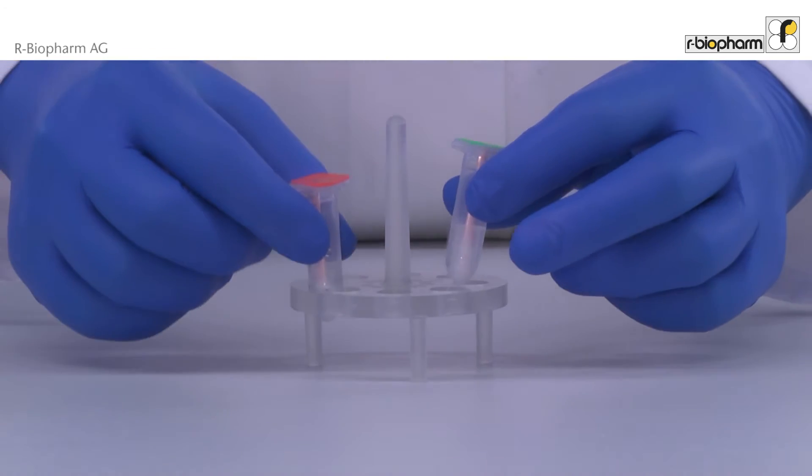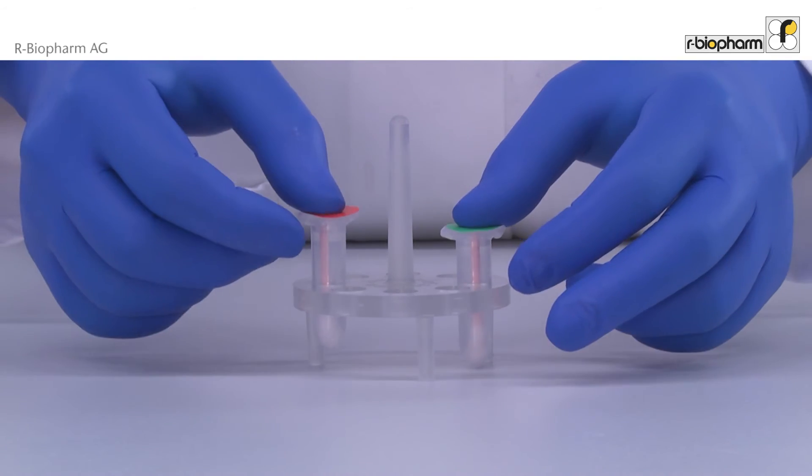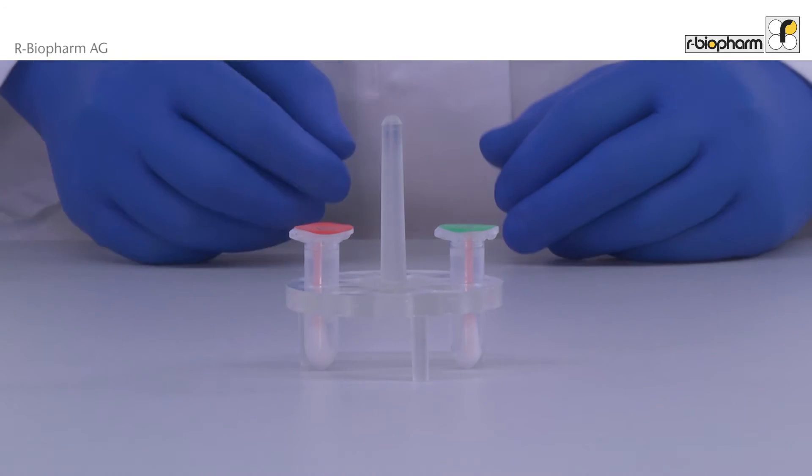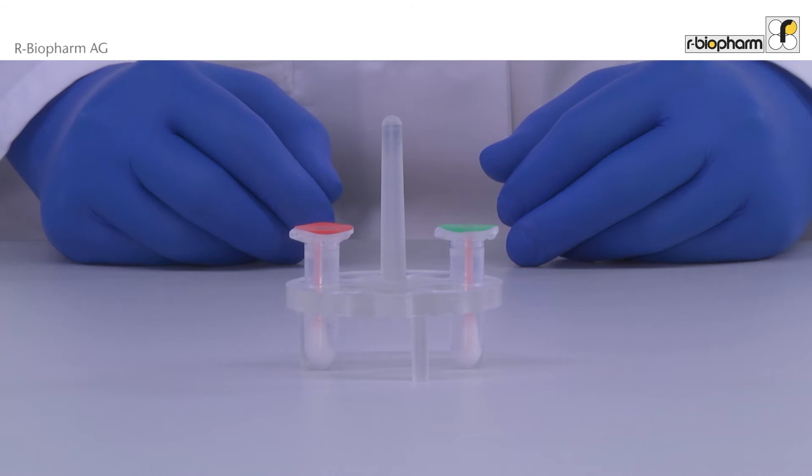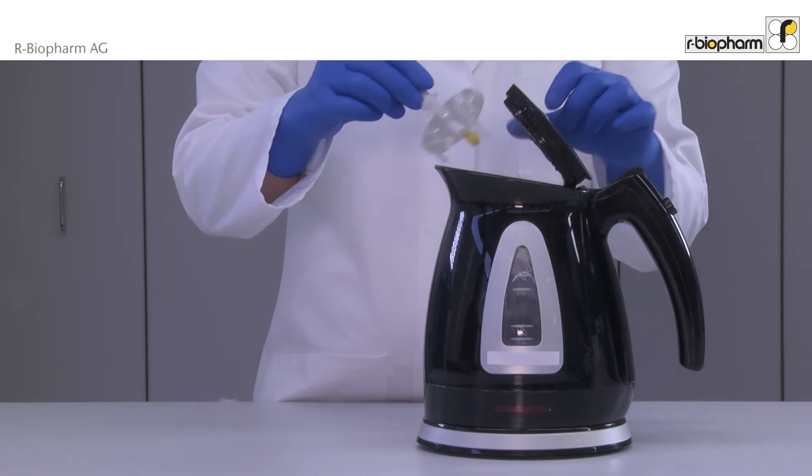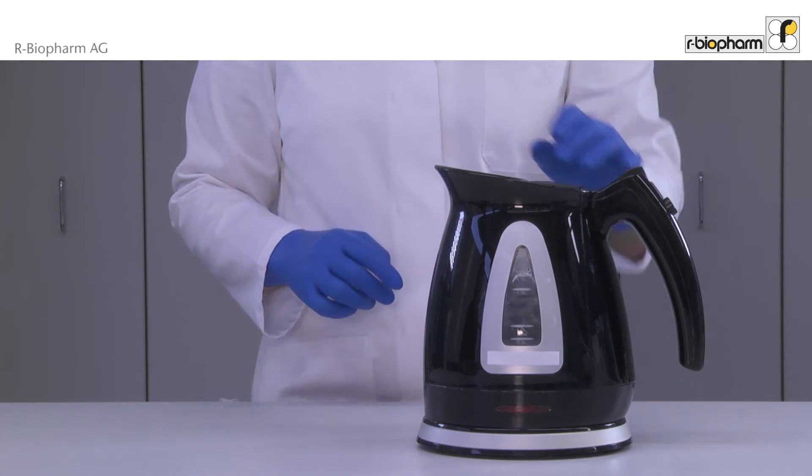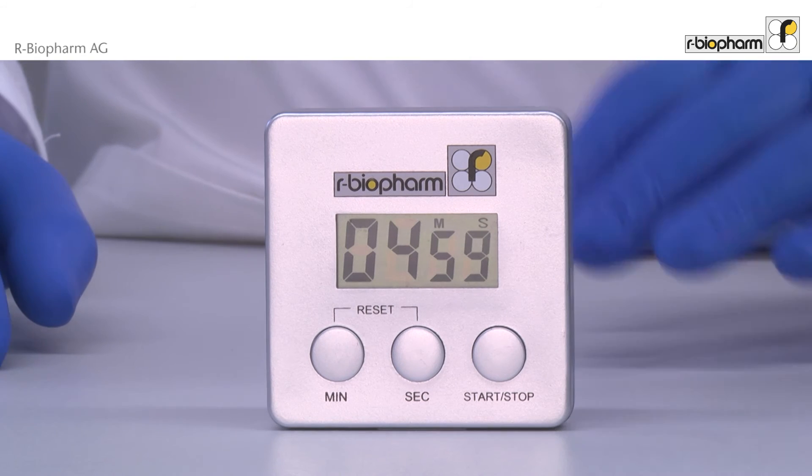Then insert the closed vials into a floating rack. Green is the surface swab and red is the blender swab. Insert the floating rack into boiling water and incubate for five minutes.